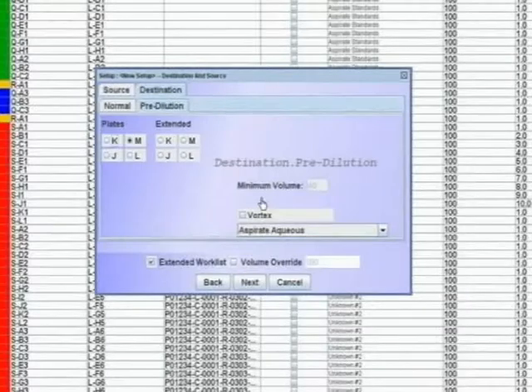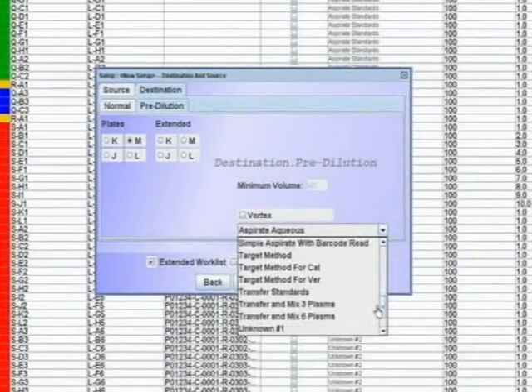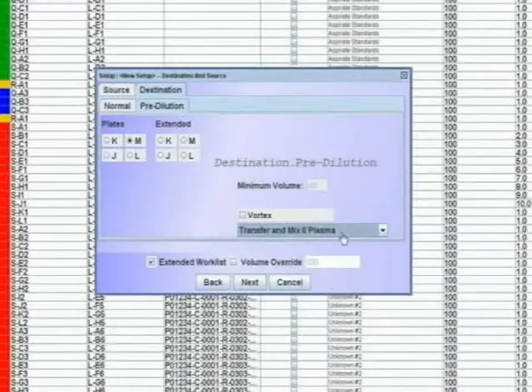The pipetter template determines the pipetting function. After mixing the 40 microliters plus 360 microliters in the dilution well, then 100 microliters would be transferred to the prescribed destination well to complete the transaction.